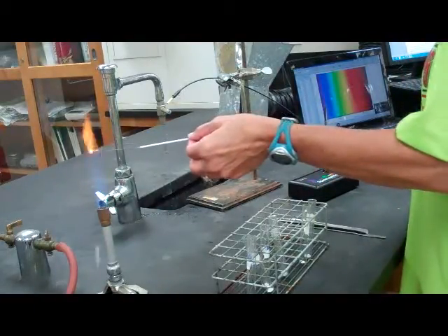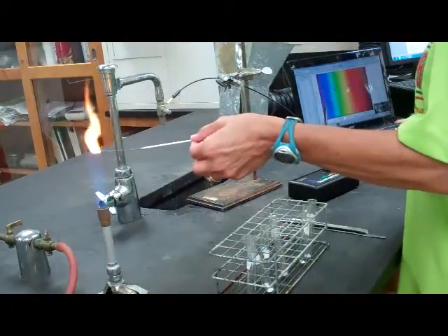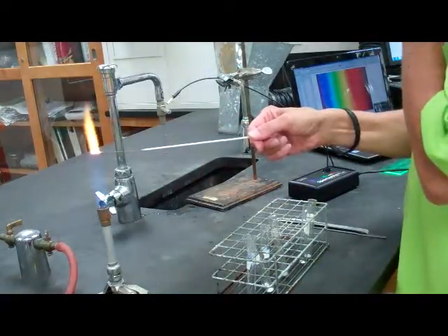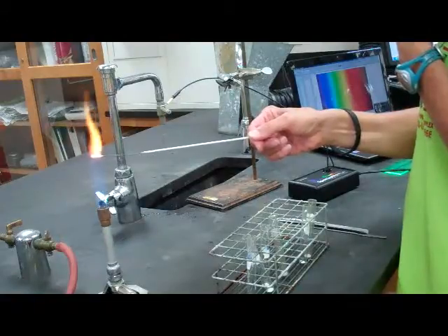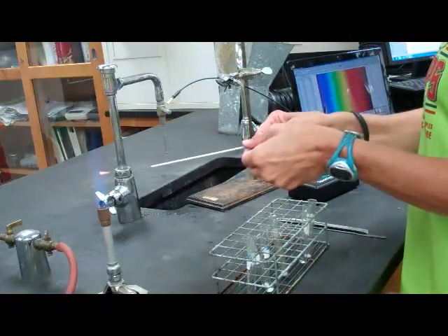When I put it in the flame, definitely getting a color change. Hit collect. I believe you see the pattern now. Store the latest run. As we burn our flame, we are getting readings.